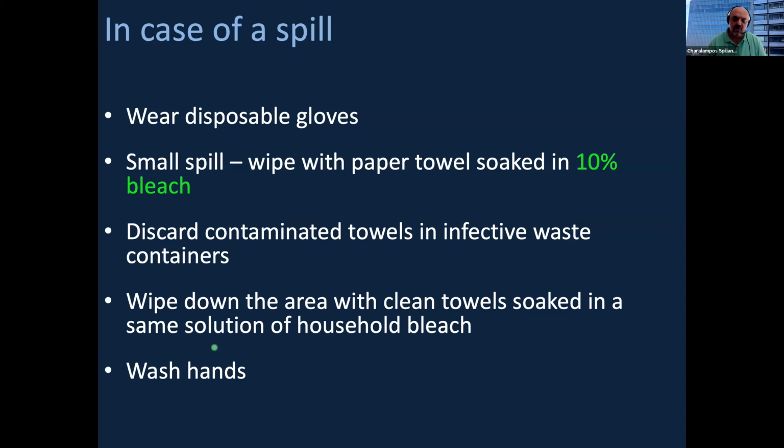Now, if you want to prepare by yourself a disinfectant that would be capable of destroying SARS-CoV-2, then the World Health Organization has the recipe available, and we do have all these chemicals in our laboratories. Instead of the 70% ethanol that I said before, here you need 80% alcohol, 1.45% glycerol. This is not of any use to our bench, but it's of use to our hands, to maintain the softness and not leave the hydrogen peroxide making our hands dry.